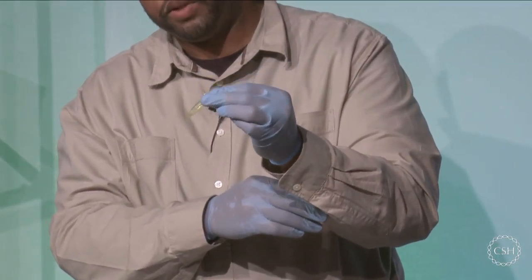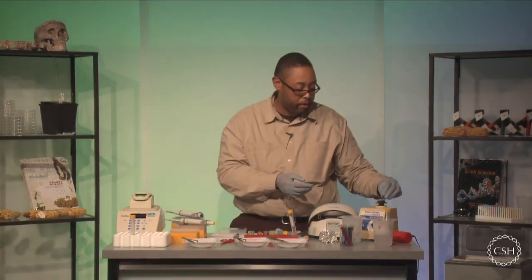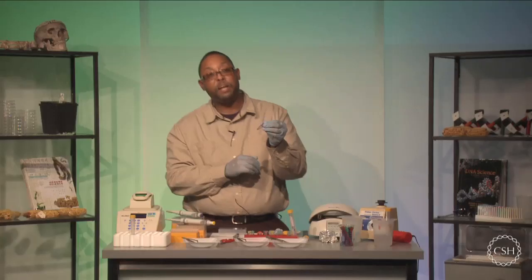And that one's pretty mixed really easily. And for the last one, I'm going to just use a vortex. If you have a vortex, it actually works rather well and rather quickly. But nonetheless, you can do a finger vortexing very quickly. Okay? And I've mixed my sample here.